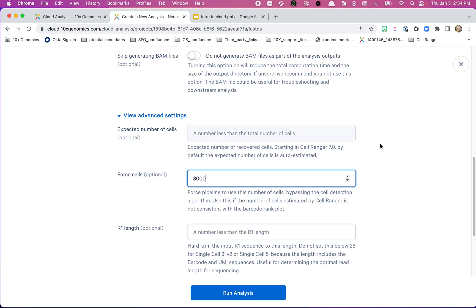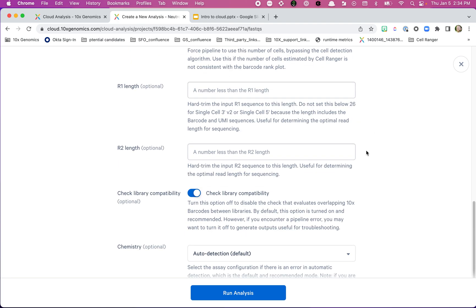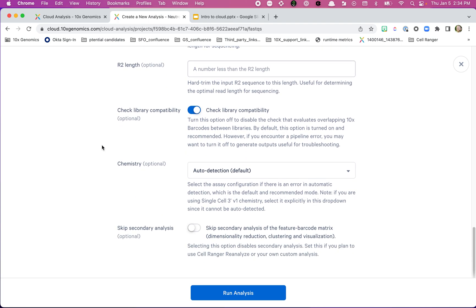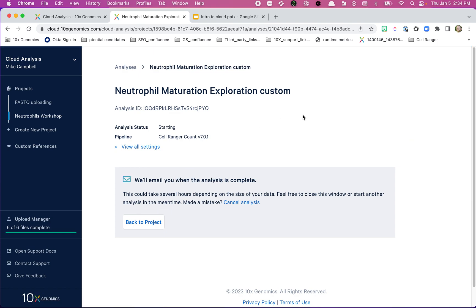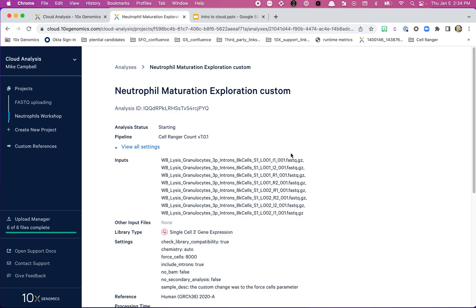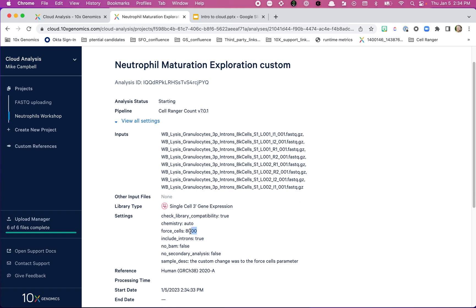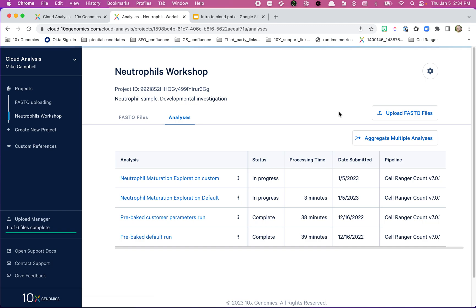You'll see where we got the 8,000 number from in one of the later videos when we go through QA and make comparisons between our default run, really looking closely at the results. There are a lot of other parameters we could change but we're not going to. We're going to hit Run Analysis. We get the same confirmation page, and viewing the settings confirms that force cells is set to 8,000. Then we go back to our analyses.